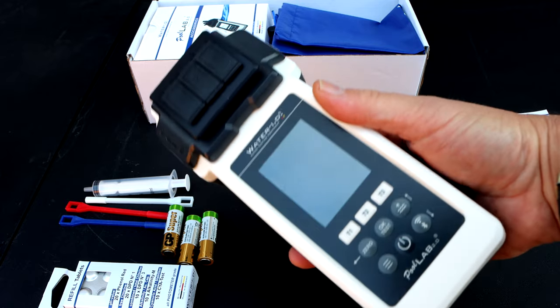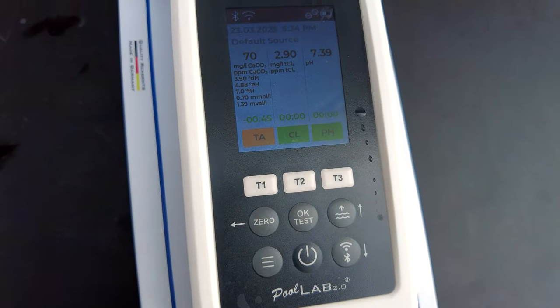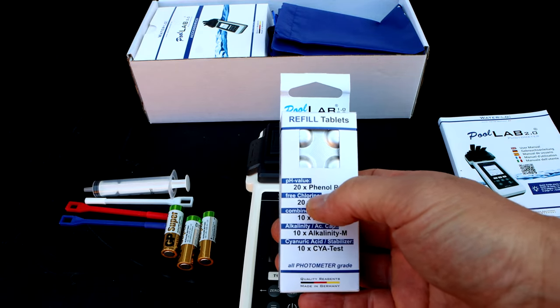At the time of this recording, this photometer can do 24 different test factors. Probably one of the most unique and best features is it can do three test factors at the same time.